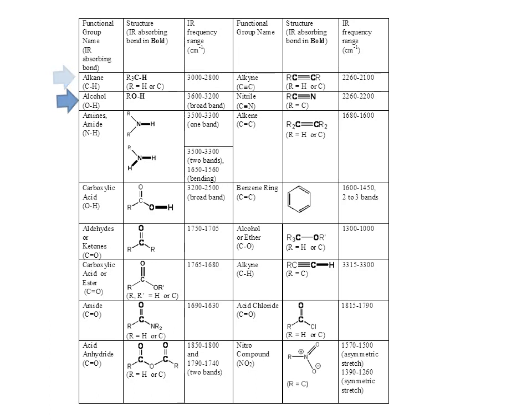Under that we have alcohols, the OH stretch. This is a peak or band which will be very broad. So the band will actually extend between 3600 and 3200 wave numbers. So we're talking about something which looks exceedingly wide, not like a little dagger.